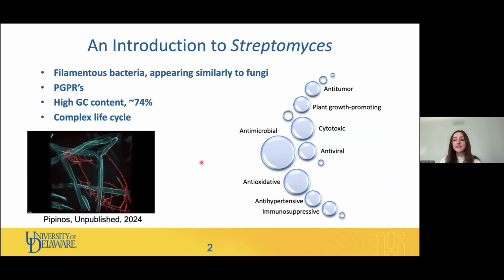Streptomyces are filamentous gram-positive bacteria. As you can see in this image I took, they look a little bit more like fungi through imaging. They have three distinct developmental phases: the vegetative hyphae phase, which you can see in this image, where there are hyphal extensions, then aerial hyphae, which is oftentimes branching from the initial hyphae, and lastly a sporulating phase. They'll form these chains and then spread off and restart the life cycle.